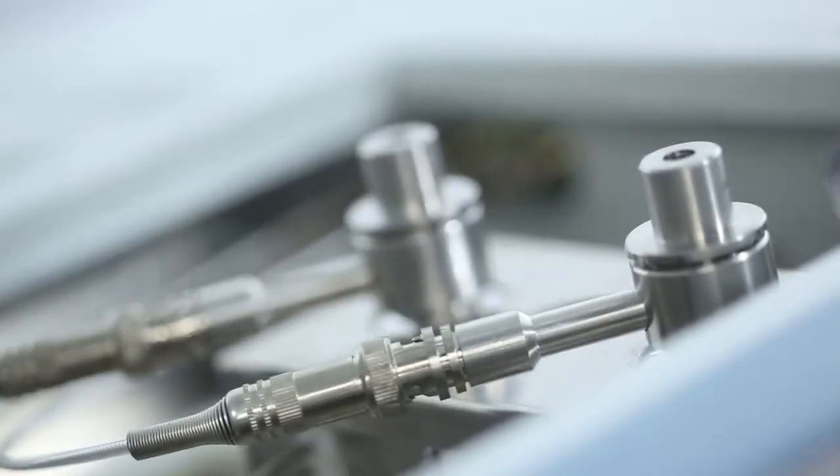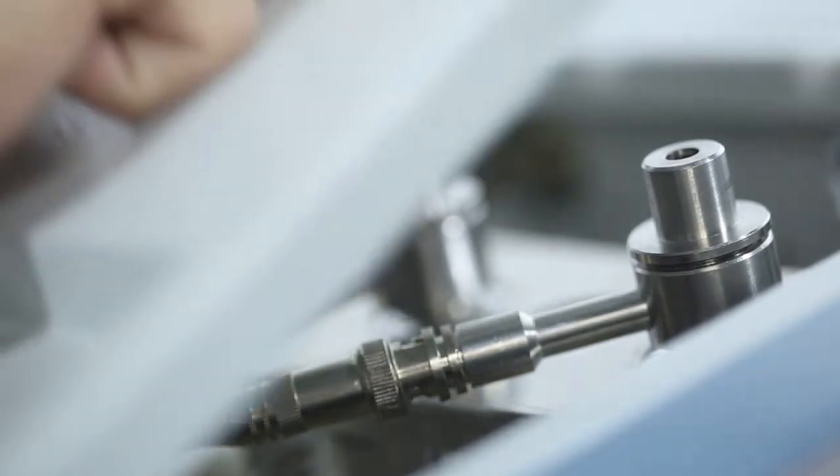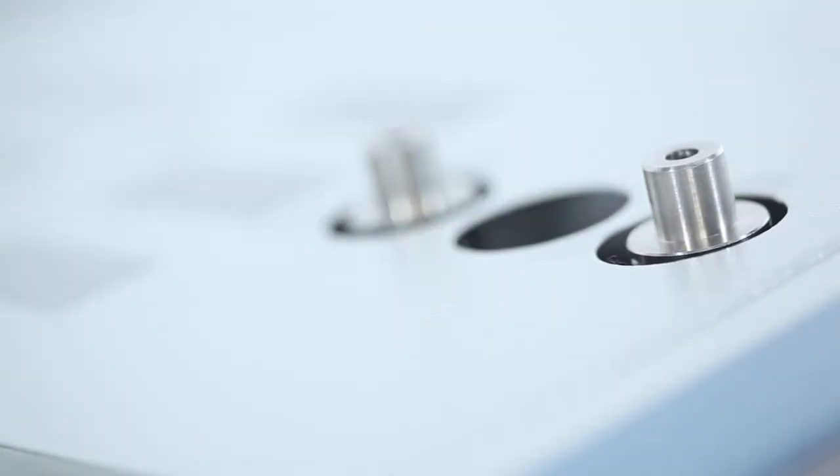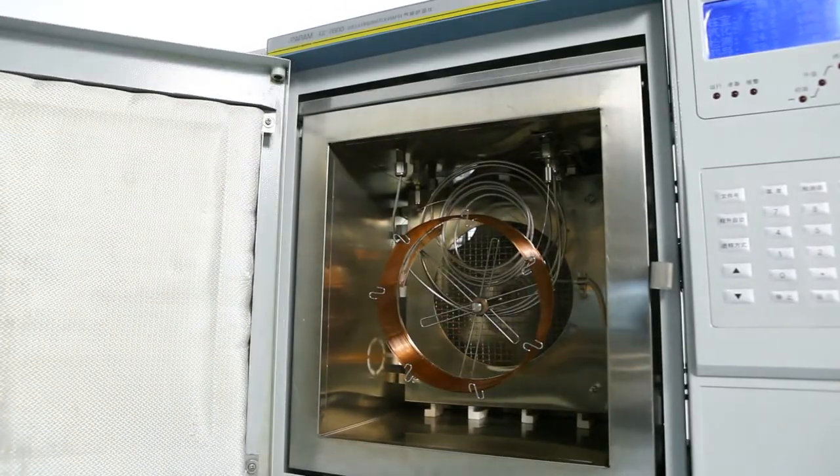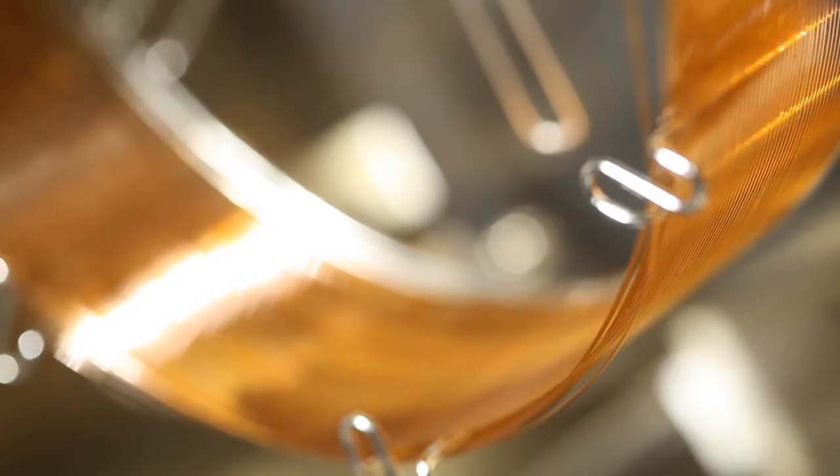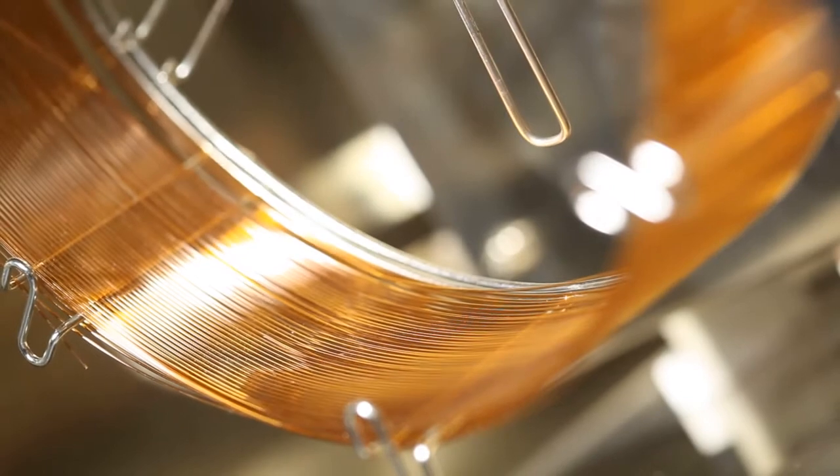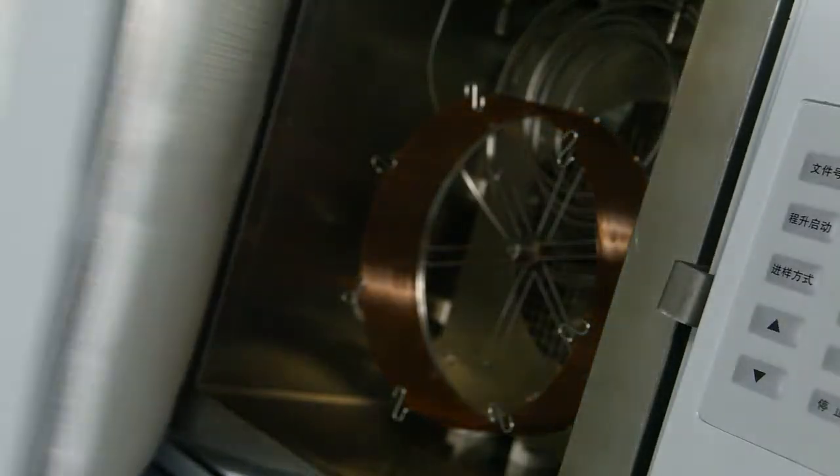The gas chromatograph has both an FID detector and a TCD detector, which are paired with a capillary column and a packed column correspondingly to test the purity of a particular substance and the relative amounts of such components in a mixture.